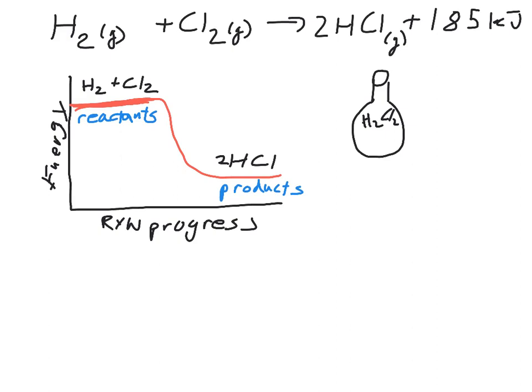If I touch this flask, it would feel hot to the touch, because as that reaction occurs, the reaction produces 185 kilojoules of heat.